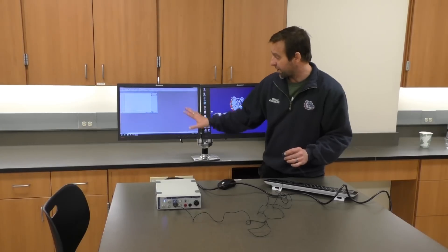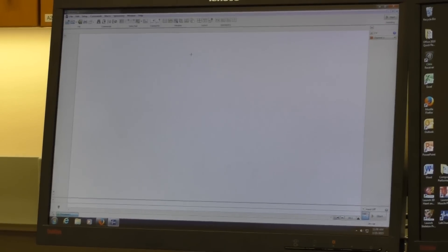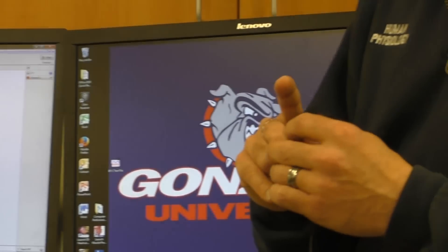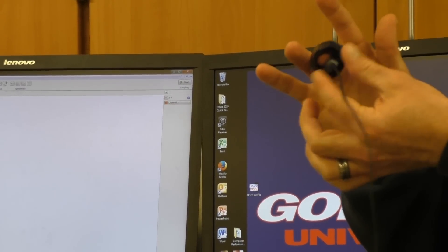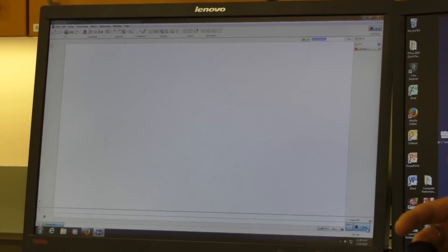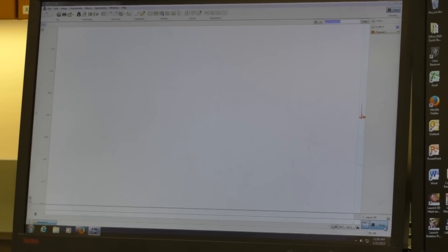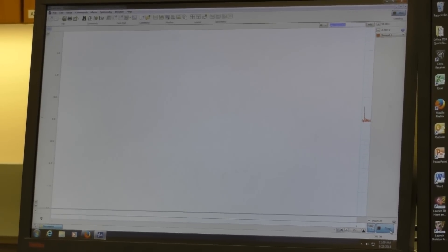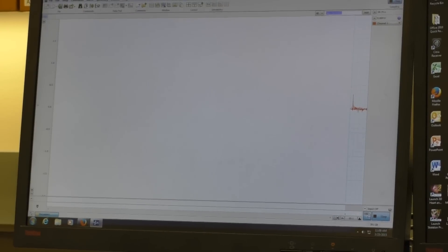Now we can see the green icon is there and we're ready to go. We have these big monitors so go ahead and maximize your screen — it's the icon next to the red X and that gives us the whole screen to look at. I'm going to put the pulse transducer on my finger snugly — tight enough where it's not going to readily pull off. Now I'll click down on the start icon. I can see there's some kind of signal moving across the screen. I need to make a couple of adjustments so the signal actually looks good and we can determine something from it — right now it looks like a really small indicator of a pulse.